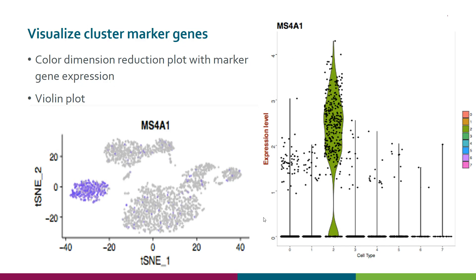We can also visualize the cluster marker genes. For example, we can color UMAP plots with the expression level of a particular gene, and you can also produce violin plots. For example, here we see that this gene is a very good marker for cluster number 2.